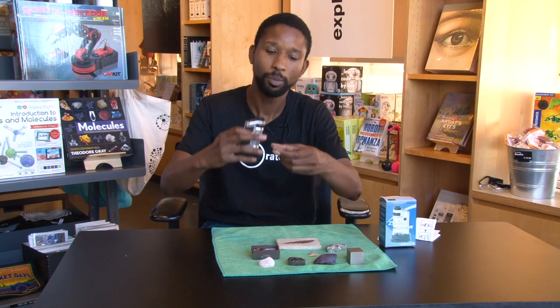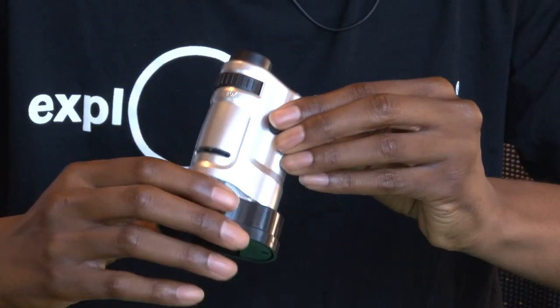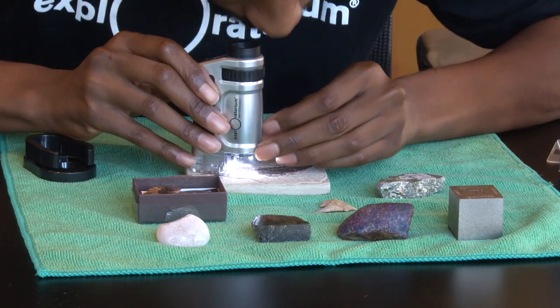You can take things, put them on the slides and put it in the slot to get a closer look, or you can make this a mobile scope by taking the microscope off the tray and start looking at items up close.